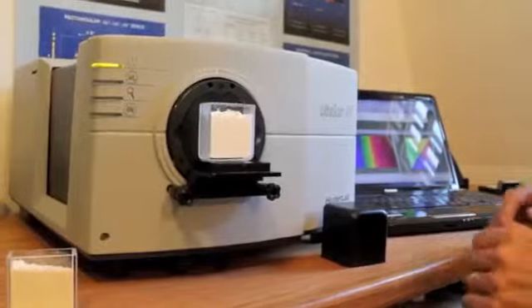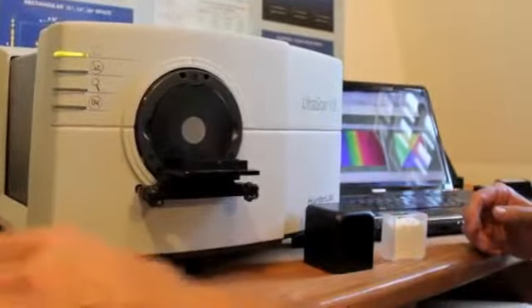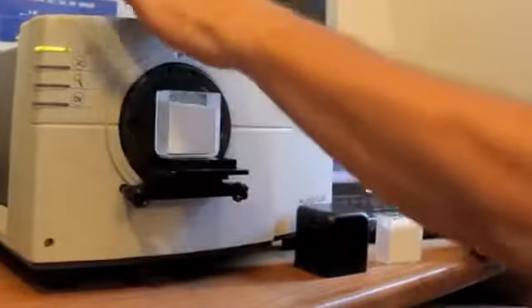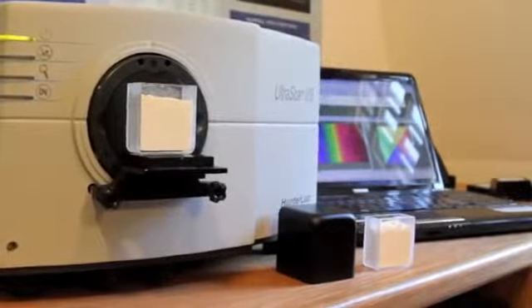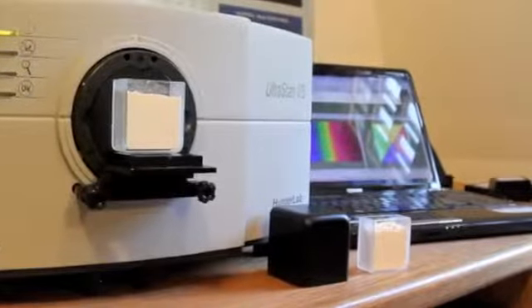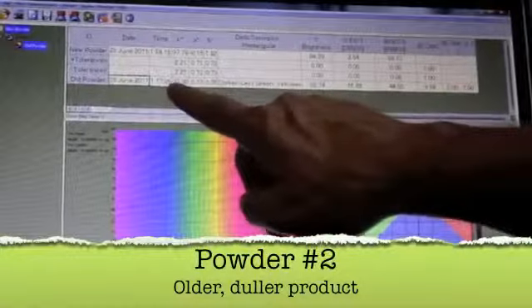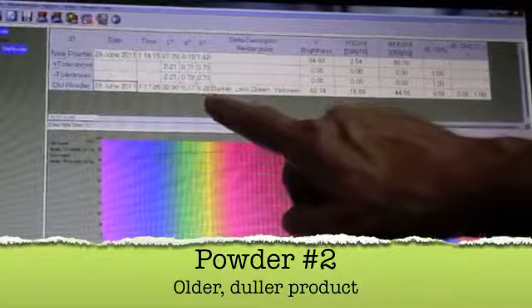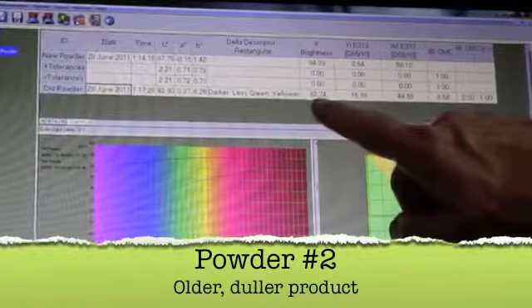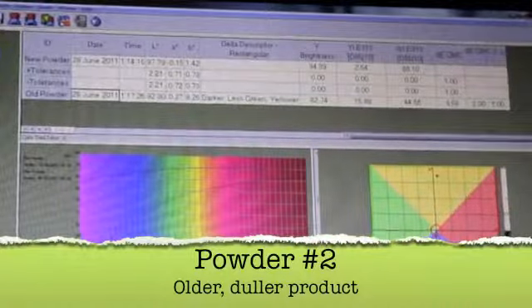Now we'll compare our new bright sample against an older product that's been on the shelf for quite a while. Our second product is much darker. The lightness value is dropping. The B value increasing, which is our yellowness. Our brightness has dropped, our yellowness has increased, and the product is much less white.